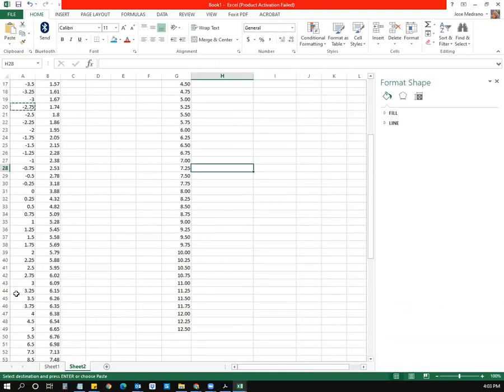Notice I was already in the positive region for the x-axis. So I want to keep that number positive as well. Same if we were in the negative region, then we want to keep the millimoles of titrant negative as well. But I said 7.8 was my estimation.